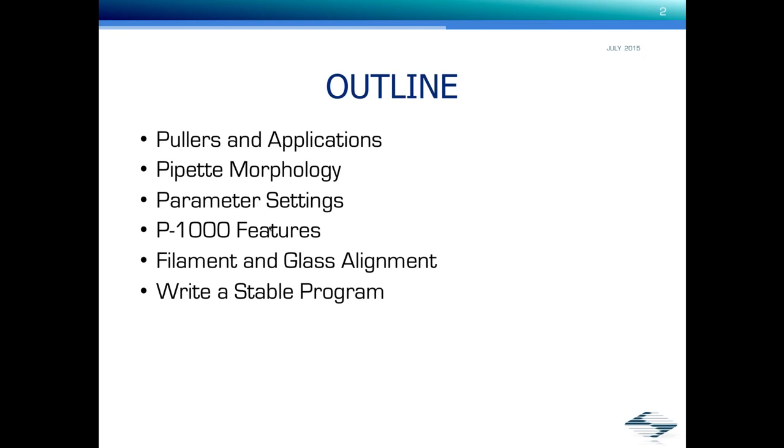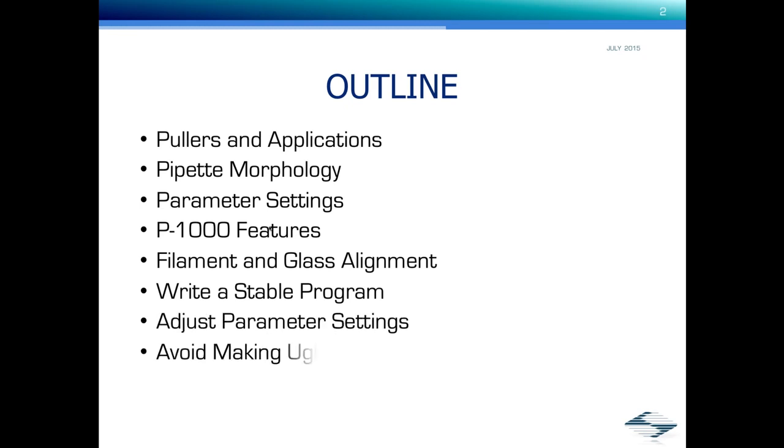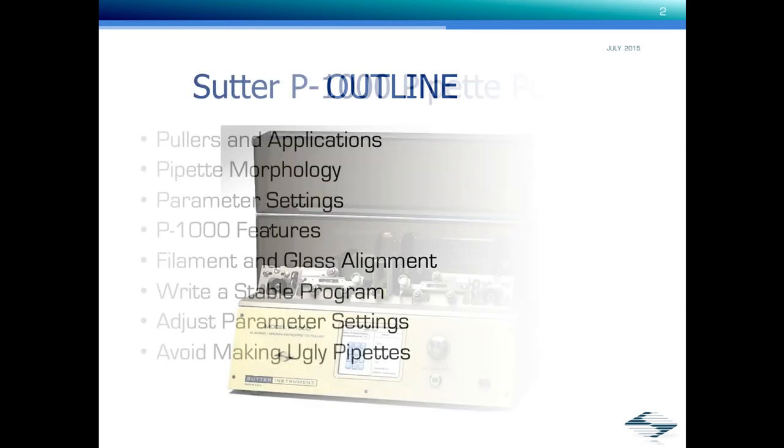To show you how to write a stable program and how to go about adjusting the parameter settings and how to avoid making those ugly pipettes.